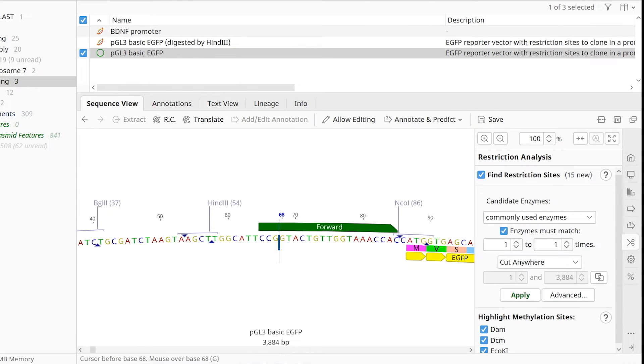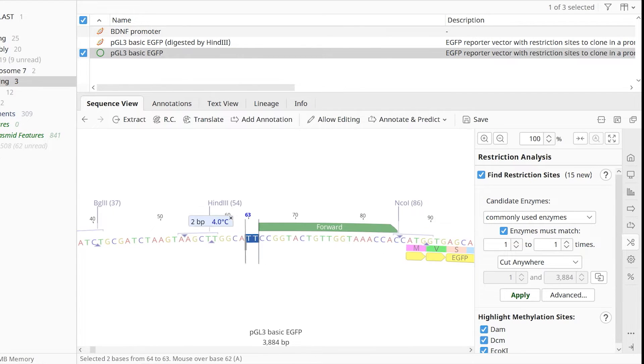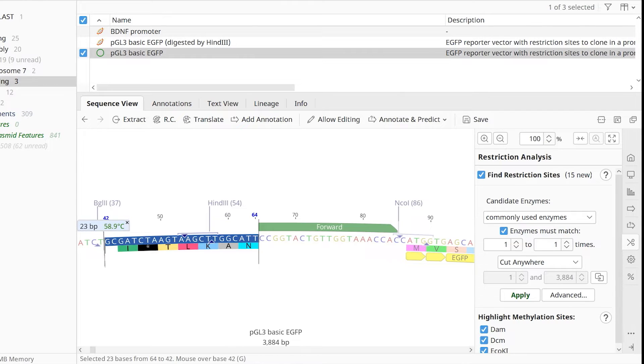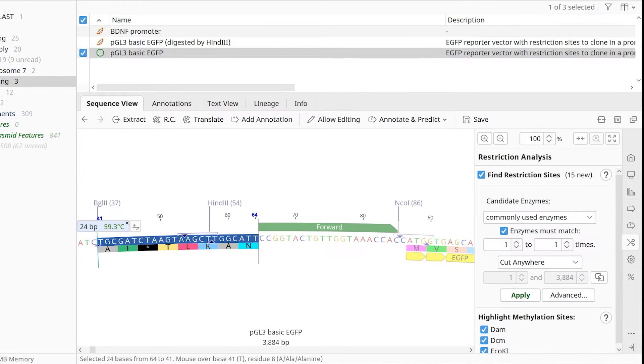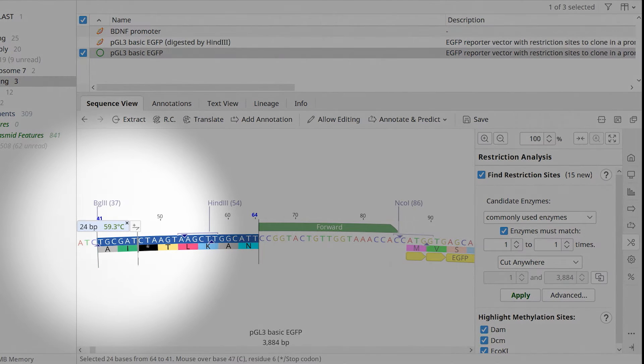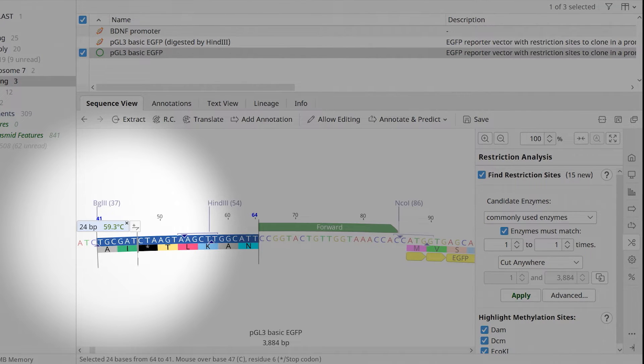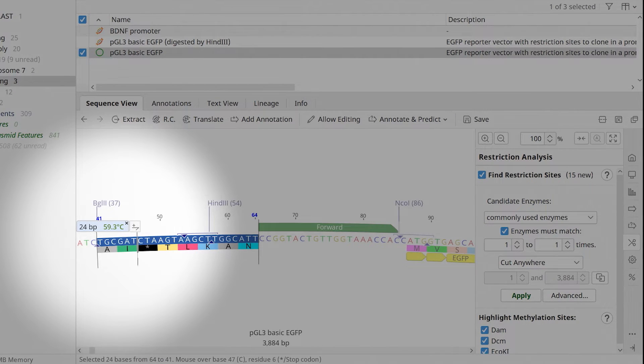For the reverse primer, start at the same desired site but this time move your mouse to the left. You are again aiming for a primer size of around 20 nucleotides and a melting temperature of approximately 60 degrees Celsius.